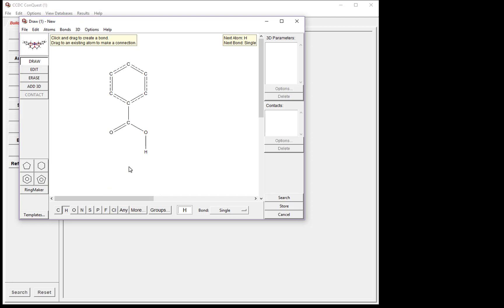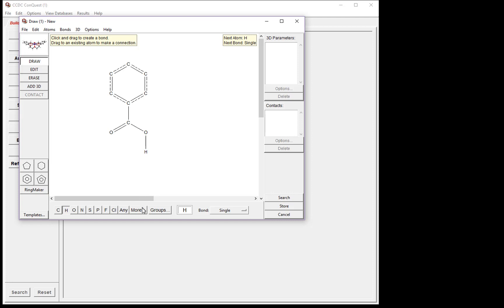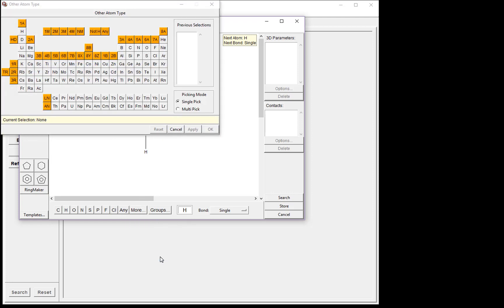For this example, we want to study the geometry around a hydrogen bond donor and this hydrogen bond acceptor here. In this example, we don't need to specify if it is a nitrogen or an oxygen hydrogen bond donor. So to select multiple atom types, click More, and then Other Elements. This brings up a periodic table from which you can choose any atom type you like. For this example, we want to choose nitrogen and oxygen.